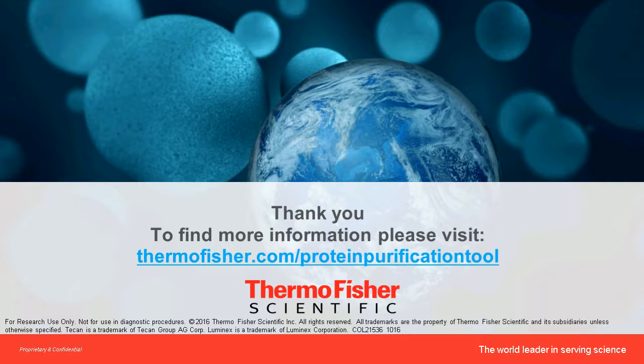Thanks, Bhavin. And our next question asks, which antibody did you use for the IP EGFR? Bhavin, is that something you can answer? Sure. We used Thermo Fisher Scientific rabbit polyclonal antibody. The catalog number for that is PA11110.